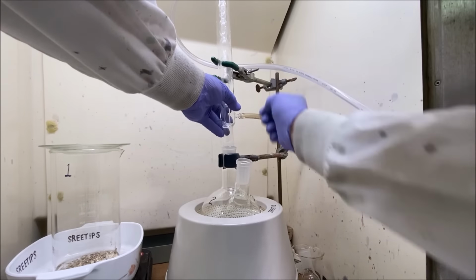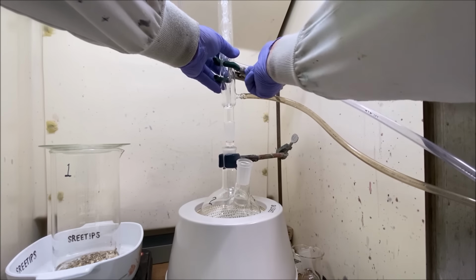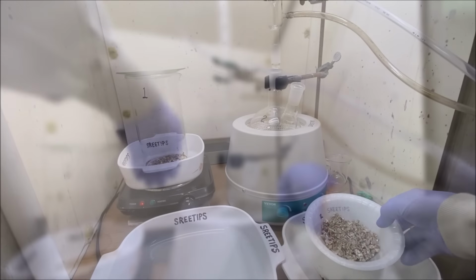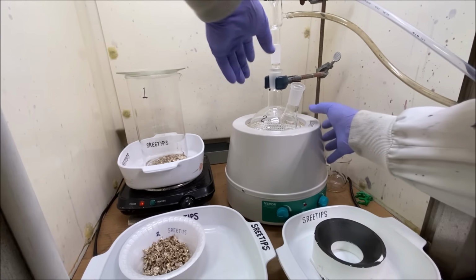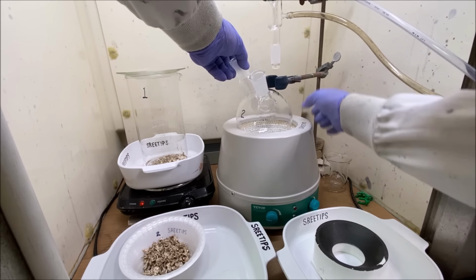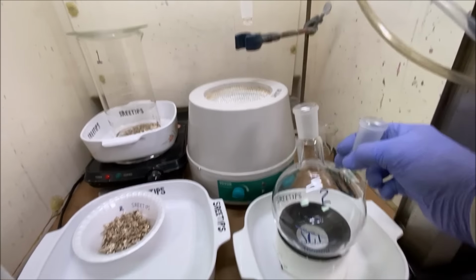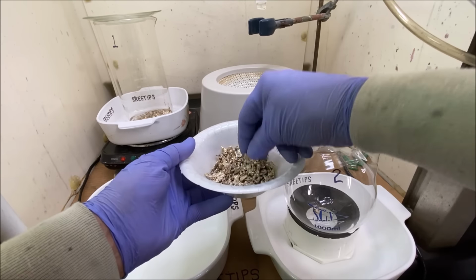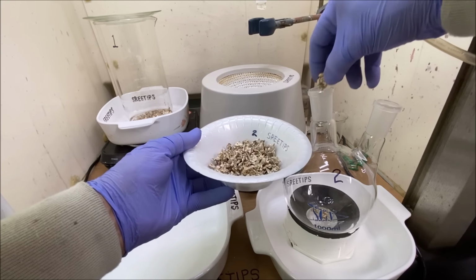Raise our condenser up out of our reaction vessel here. It's awful crowded in here. And so what we're gonna have to do is move this out a little bit so that I can get access to the flask. Now what I'll do is start adding these granules of inquarted gold into our flask.